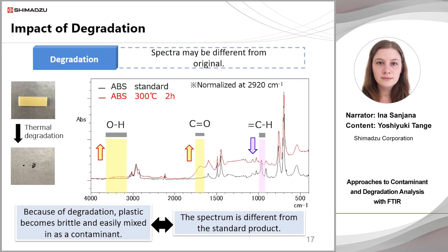There may also be spectral changes due to degradation. This example shows acrylonitrile butadiene styrene, or ABS, processed in an oven at 300 degrees for two hours. When plastics are degraded, they crack and lose flexibility, and inevitably get mixed in as contaminants. The spectrum of a degraded product is different from the spectrum of the standard product. Peaks of OH and C=O double bonds due to oxidation are particularly noticeable in heat degradation, so searching the standard library will not result in the best match.